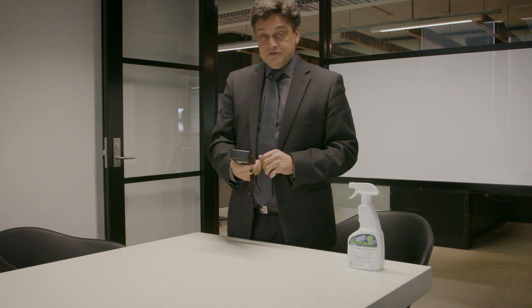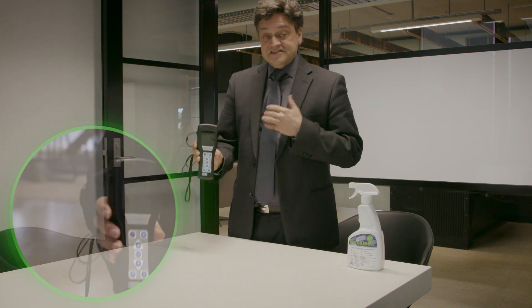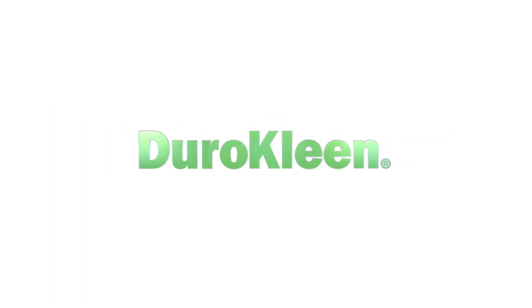Five, four, three — we're just nearly there. Our result is 16. We are well and truly under 30. So that's a successful test of how good DuroKleen is. Enjoy DuroKleen. Thank you very much.